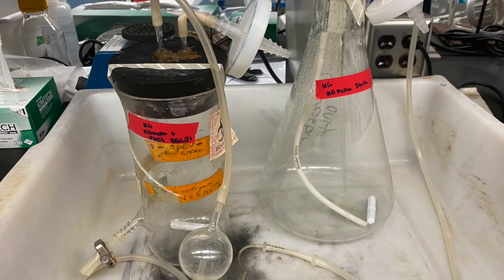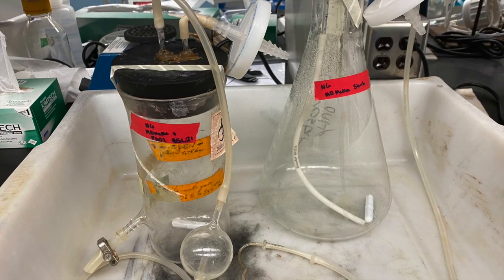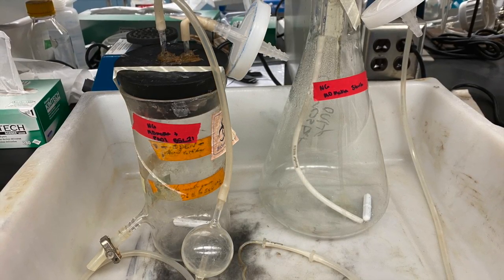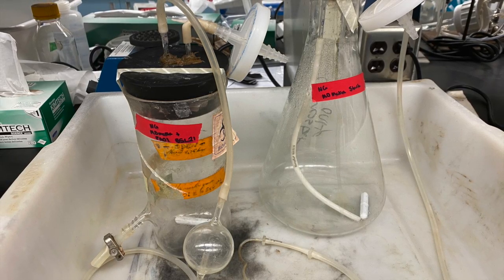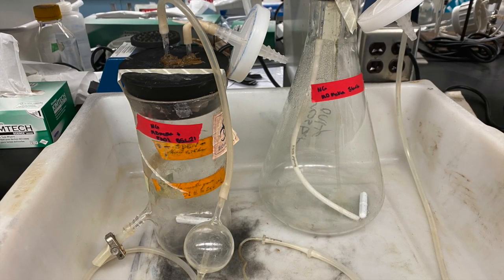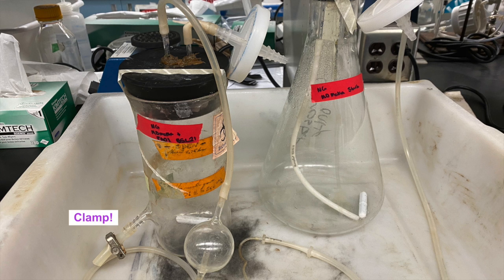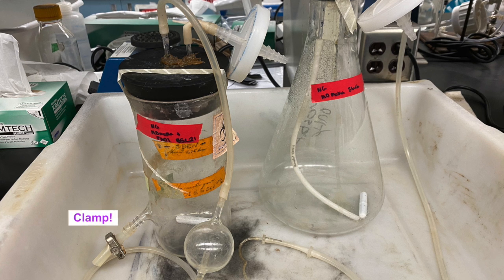After the chemostat has been rinsed, it will be autoclaved. The chemostat equipment will be autoclaved fully assembled. All parafilm around the tubing and around the lids will be removed. Parafilm cannot withstand the heat in the autoclave and will melt.